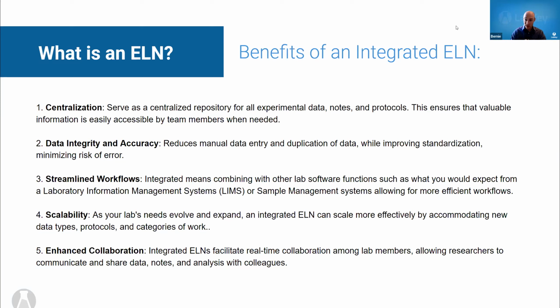Instead, with these integrated systems, you can simply go find the notebooks for that protocol, and have all of the data present there, all of the analyses present there, or on the other hand, you can go and find the relevant piece of data, or say all of the data that you have for a particular antibody or whatever it is that you're working on, and see all of the notebooks associated with it, and you're just done. Or in fact, better yet, the person asking you for this new analysis or report can simply go look at it on their own, because it's organized and they have permissions to do so.